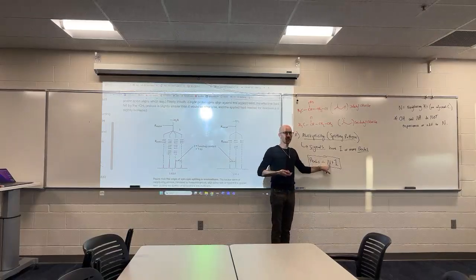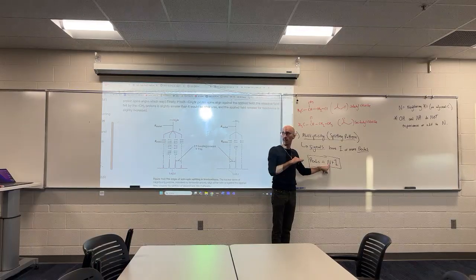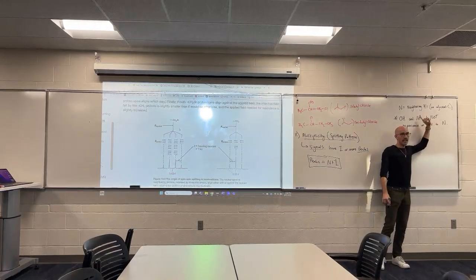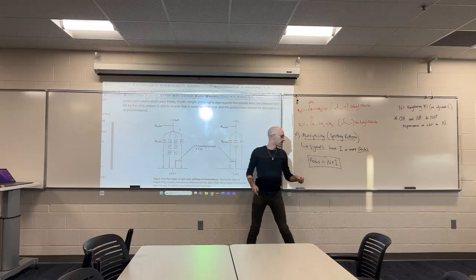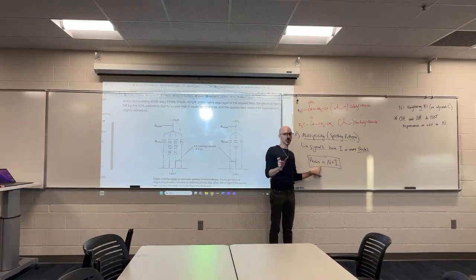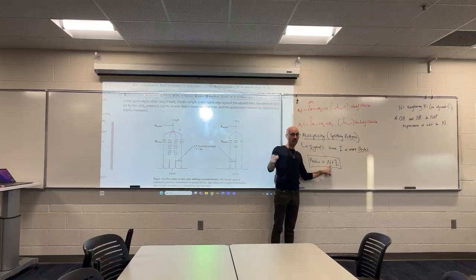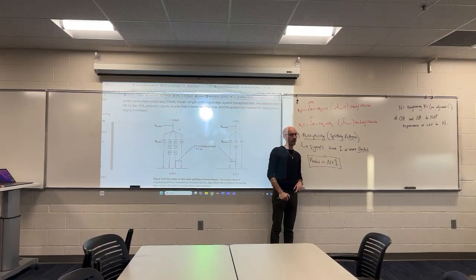N is always 0. They don't experience N. They don't count as N. Those hydrogens on oxygen always have one peak. NH and NH2 as well. The hydrogens producing a signal from NH or NH2 don't have neighboring hydrogens. They don't count as neighboring hydrogens. So those signals always show up with one peak. It's with the carbon groups where we get more complicated.